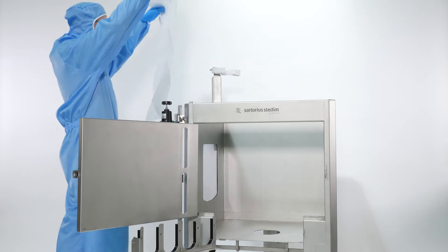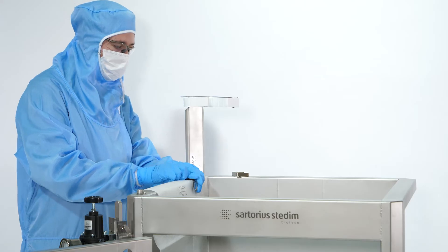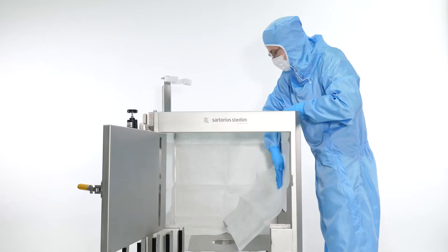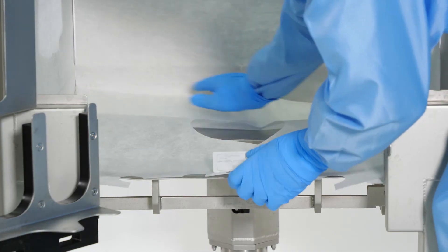Insert the fleece marked with 1 on the left-hand side of the pallet tank, using two clamps for fixing the fleece. Repeat the same operation to install the back and right-hand side fleeces, also marked 1. Insert the fleece marked with 2 at the bottom of the pallet tank.